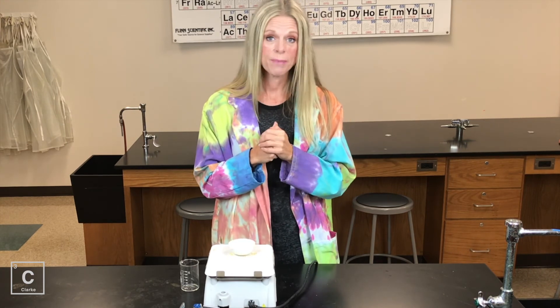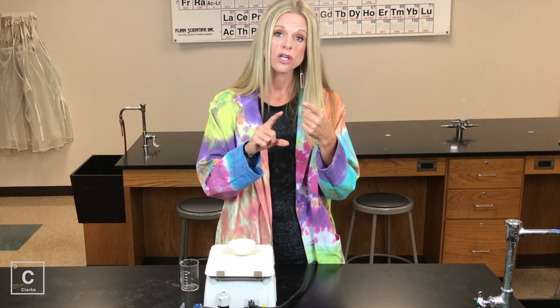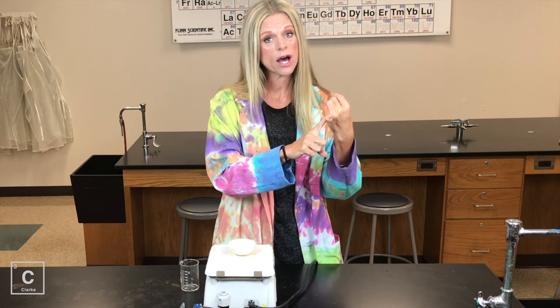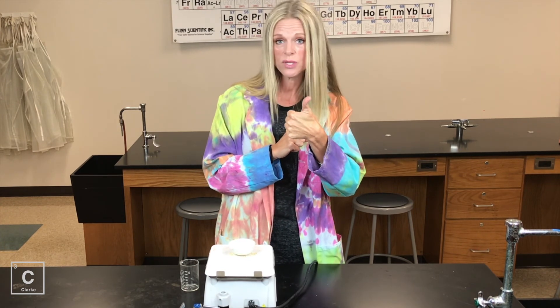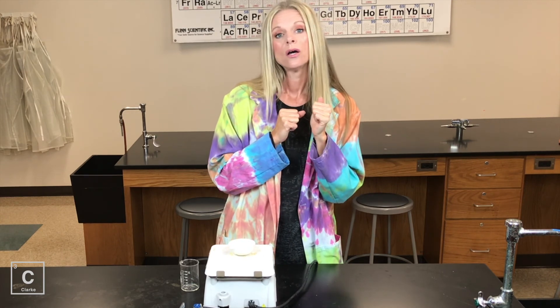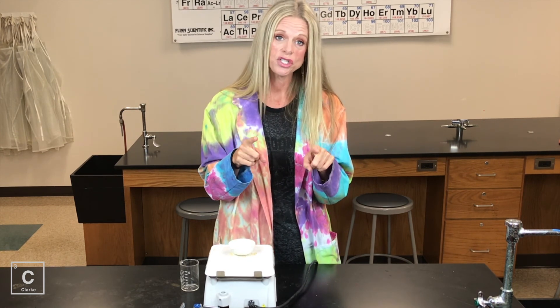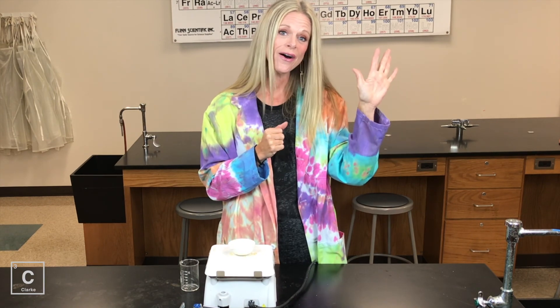This is all of the basic lab skills that I wanted to talk to you about right here at the beginning of the school year. We talked about how to put together the Bunsen burner, how to light the Bunsen burner, how to produce that hot flame and where the hottest part of the flame is, what chemical reactions look like, how we measure reactions, and we also talked about filtration and lastly evaporation. I really hope this has helped you and it's going to set you off to have a good successful year in the chemistry lab. Until next time, bye y'all!